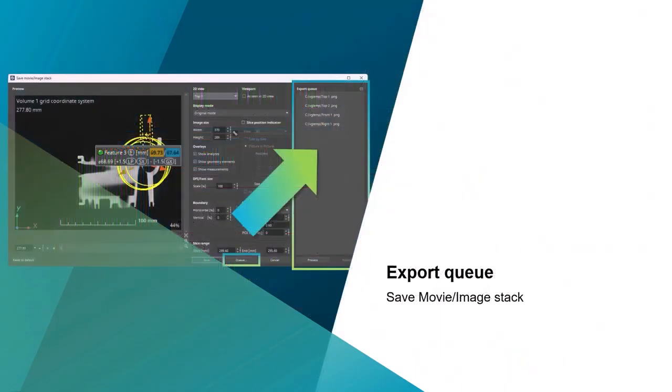And last but not least, export queue for Save Movie Image Stack. Instead of waiting for render jobs to finish, only to start new ones immediately, you can now line up multiple image stack exports at once and let VGSTUDIO MAX batch process the queue while you enjoy a well-deserved break. Cheers!